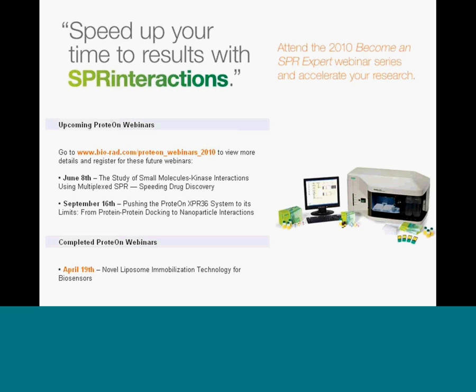Yes. Okay. And did the results show that these residues were indeed involved in this interaction? How did they affect it? So to summarize, we saw that there were 8 different residues in that interface on the side of the ligand. 2 of those residues, which were within 3.5 angstroms, did not have any effect on binding. 2 of those residues completely abolished binding when they were mutated. Those were the 2 arginine residues. And then 4 of the residues, when mutated, led to diminished binding.